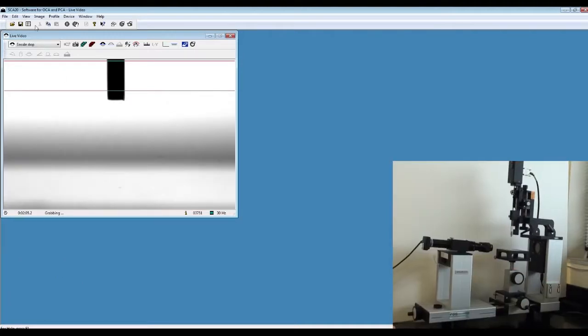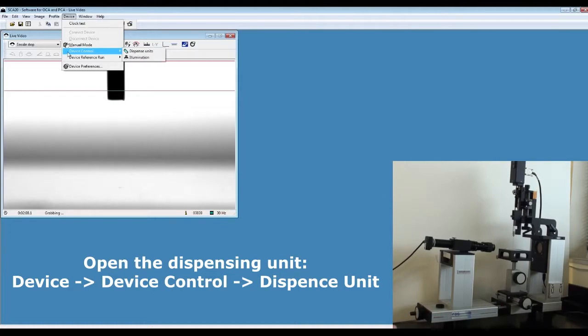Go to Device, then Device Control and Dispense Unit.